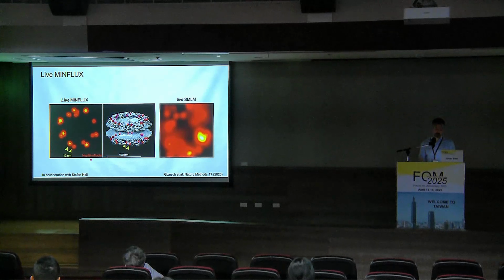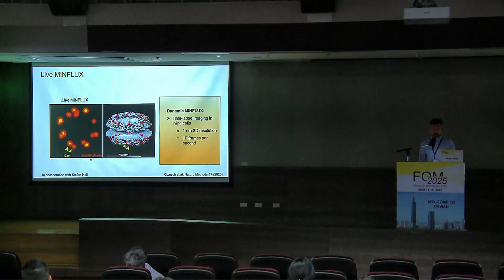And the reason is, of course, that these fluorescent proteins are rather dim, and with MINFLUX, we get the higher localization precision. Now the question is, will we be able to use MINFLUX really for dynamic imaging to look at conformational changes or rearrangements of these proteins, let's say opening, closing of the nuclear pore complex, or in endocytosis, rearrangement of the clathrin lattice with the nanometer 3D resolution that MINFLUX offers, and that with a sufficient time resolution?